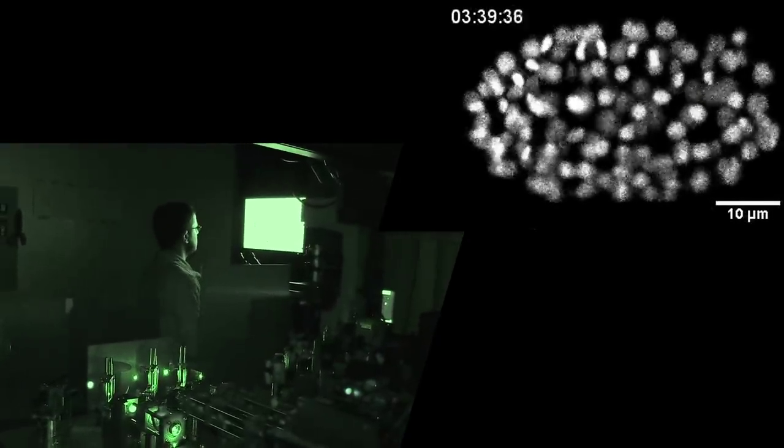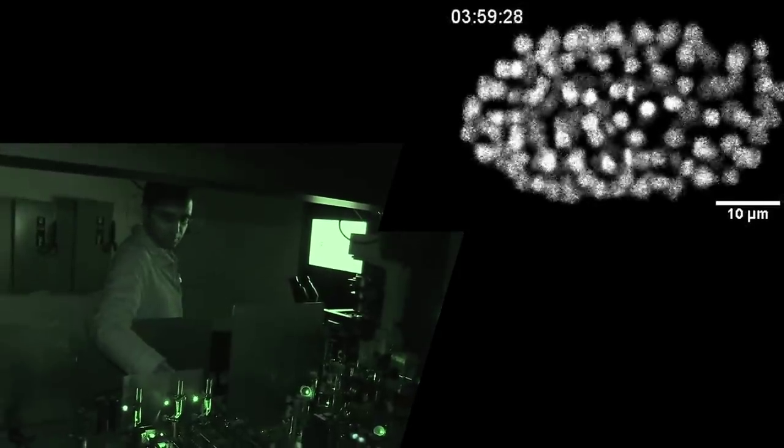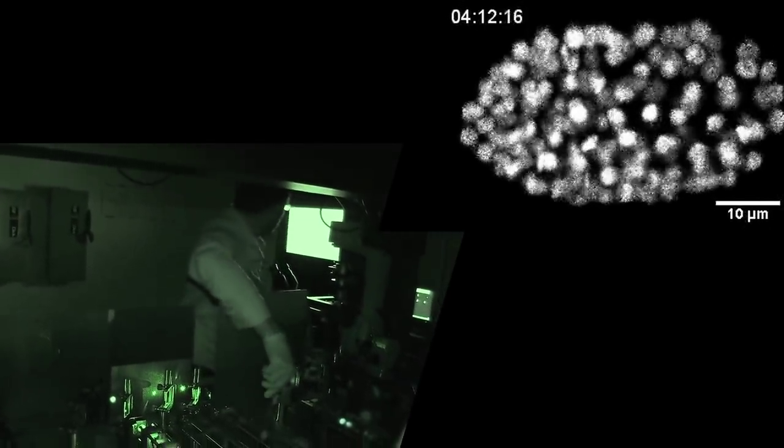For somebody like me that tries to make better tools for biologists, the NIH is a great place because we're surrounded by biologists that are investigating all sorts of different systems, everything from molecules to cells to whole animals.